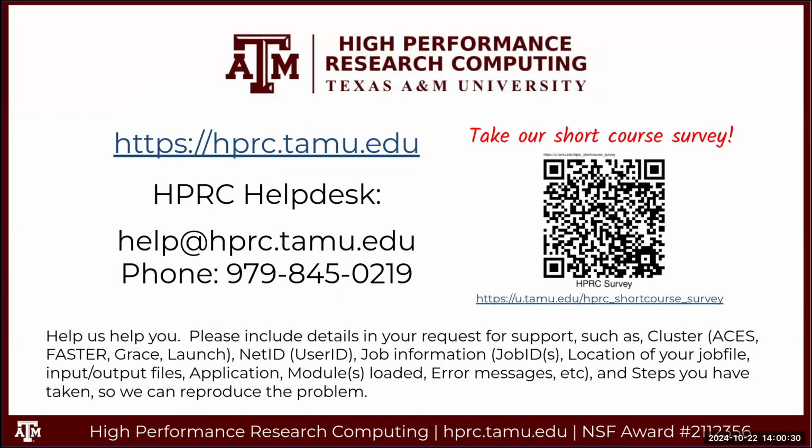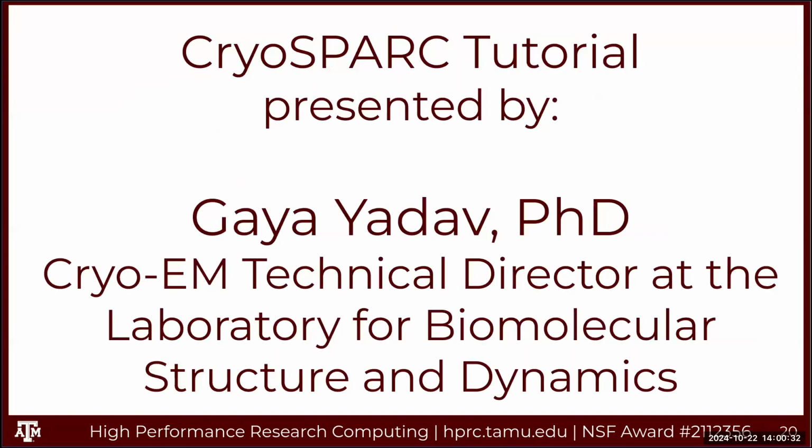So let's go ahead and see how many people we have connected to a CryoSPARC session with a GPU. If you can raise your hand, I see one. Jeffrey has his hand raised. Do we have one person connected? Do we have anyone else? I think we had one other person that didn't have an access ID. So if you have any questions, go ahead and unmute yourself and ask before we go to the next interactive tutorial session.